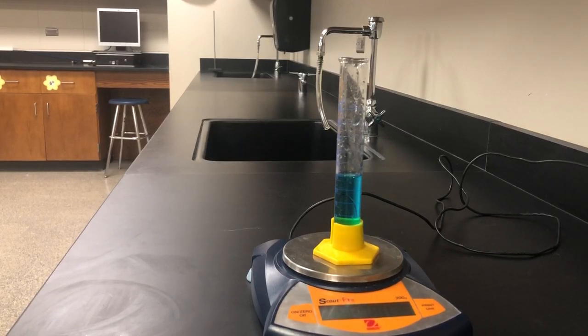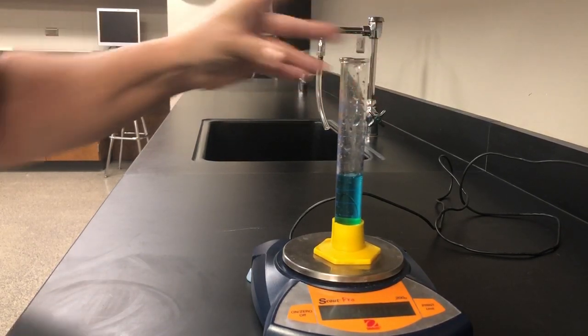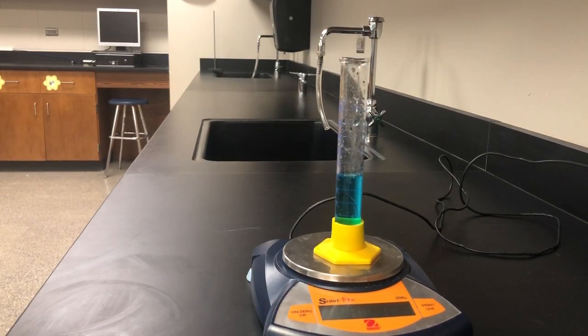Now my mass says 27.50 grams. I'm going to turn it and get eye level with it. Remember, my graduations go by one, and I can tell that it's between the 26 and the 27, closer to 27. So I'm going to estimate it at 26.7 milliliters. That 0.7 is my estimation.